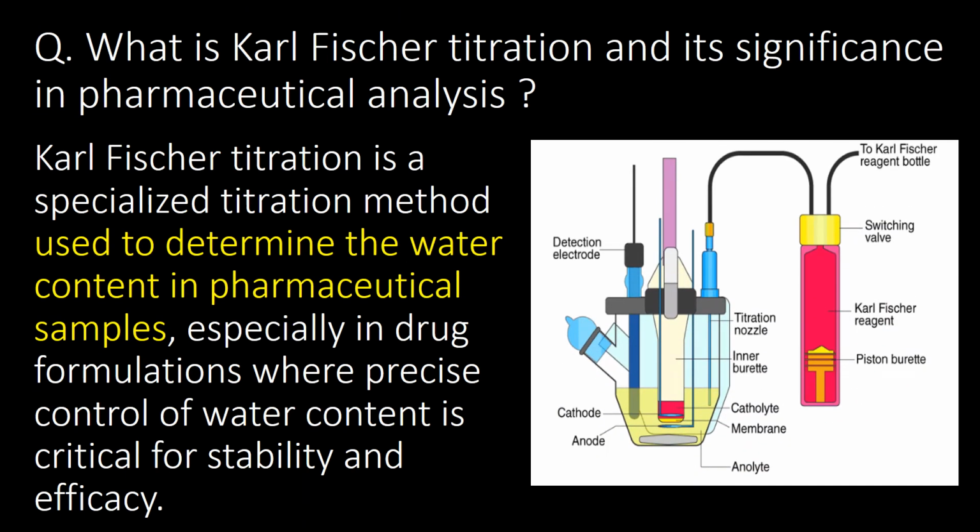What is Karl-Fischer titration and its significance in pharmaceutical analysis? Karl-Fischer titration is a specialized titration method used to determine the water content in pharmaceutical samples, especially in drug formulations where precise control of water content is critical for stability and efficacy.